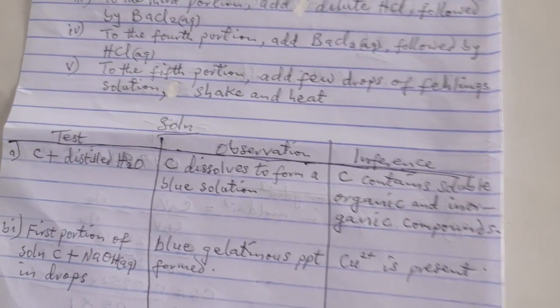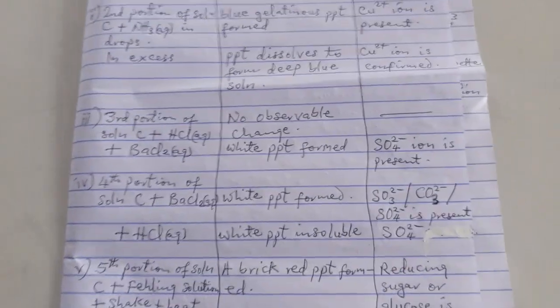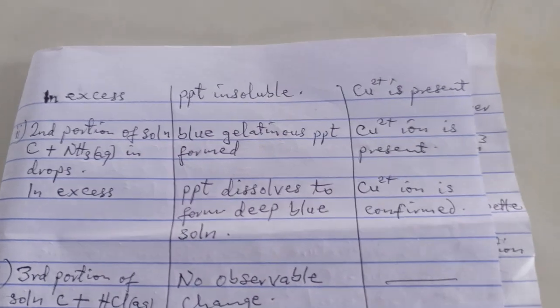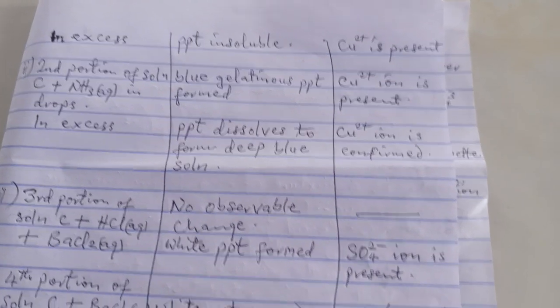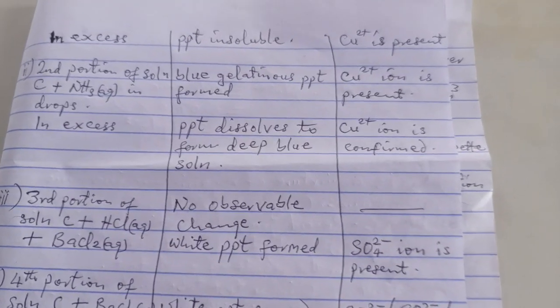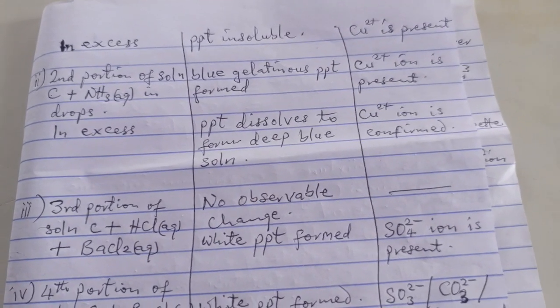So that's the reason the inference says Cu2+ is present. Okay, so when you go to in excess, adding it in excess, the PPT that was formed does not dissolve, and we said PPT insoluble. Then you should know that that is Cu2+.